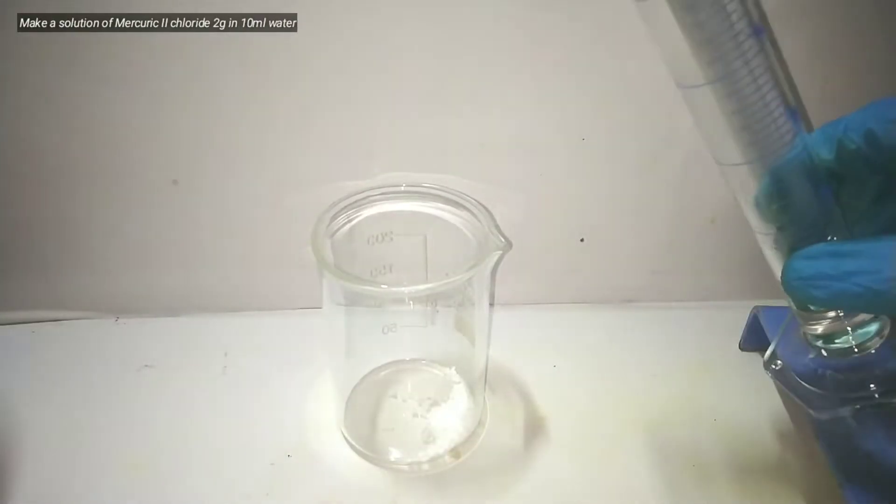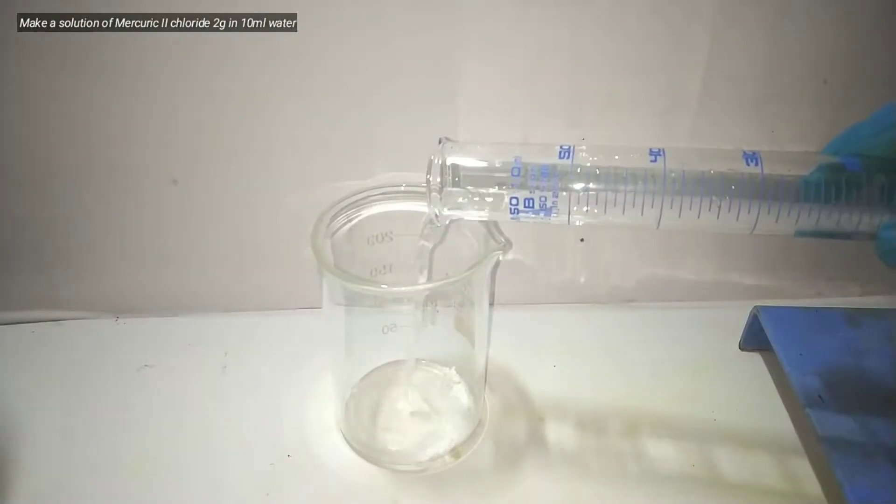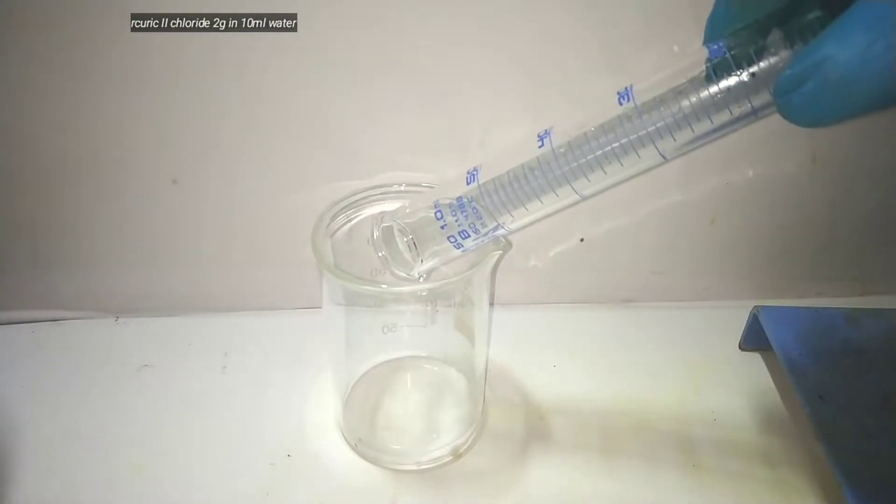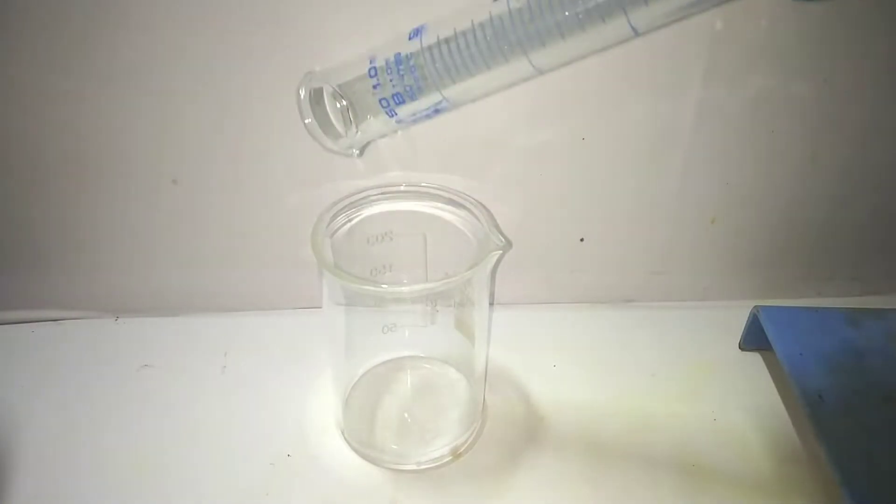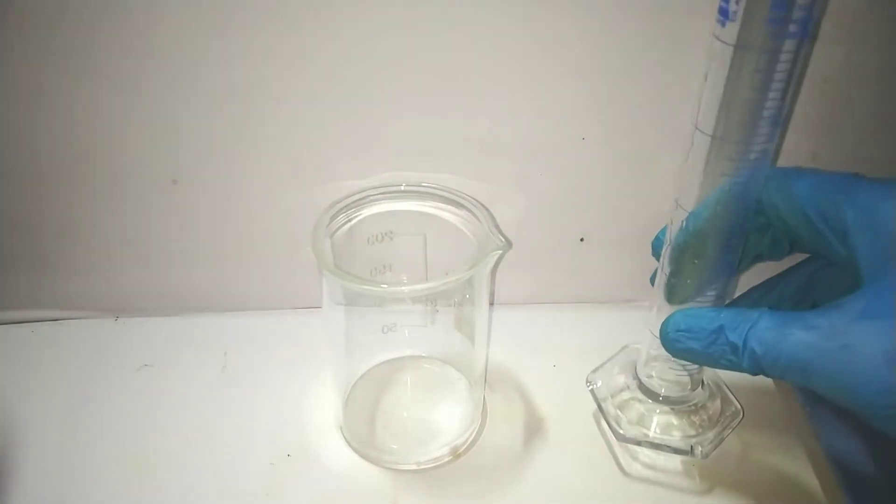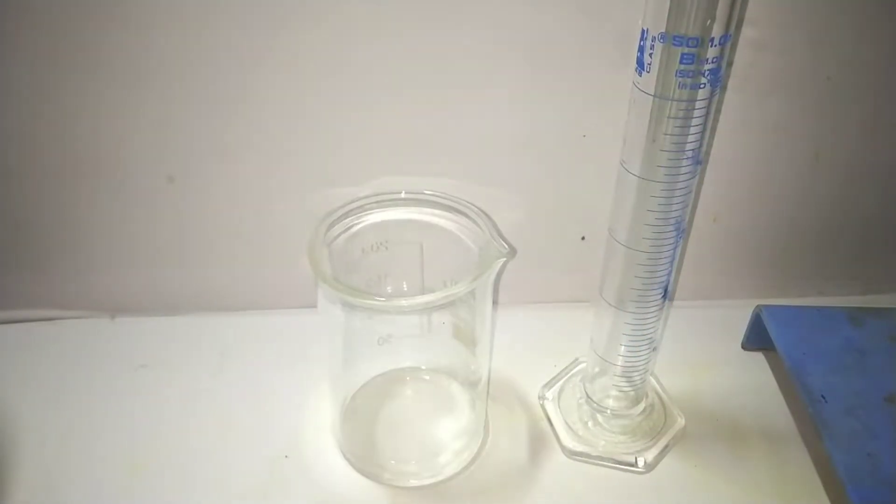Meanwhile we prepare a solution of mercury(II) chloride by dissolving 2 g of mercury(II) chloride in 10 ml of distilled water. Be very careful while handling soluble mercury salt.